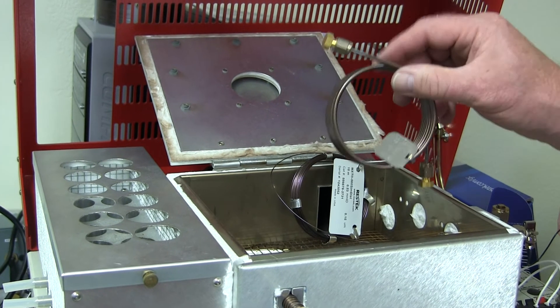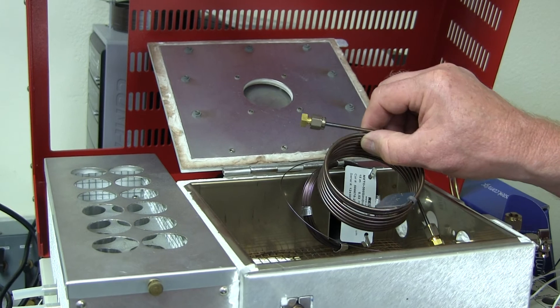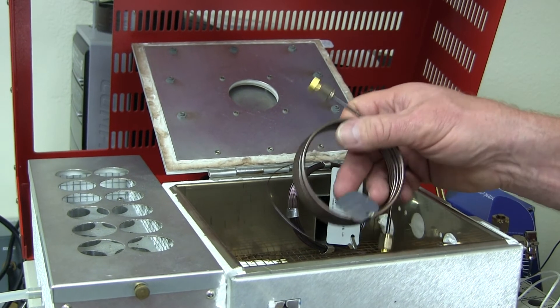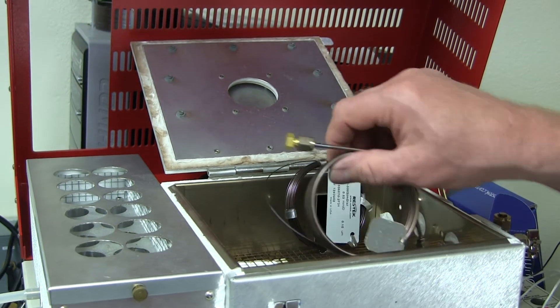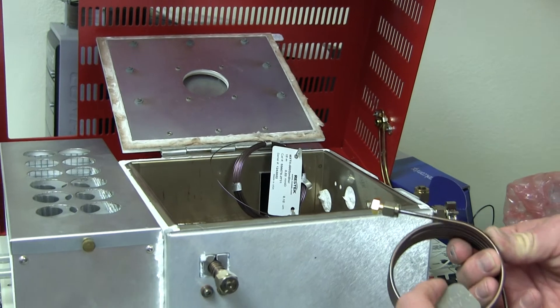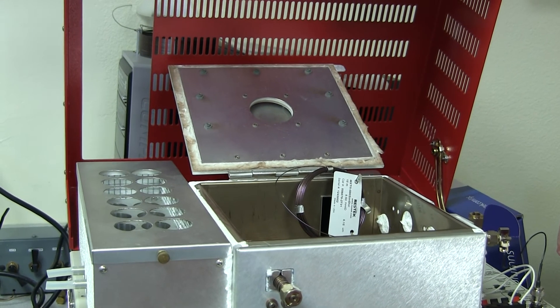It sometimes happens that there's more than one column in a column oven, sometimes two or three or four. So you really have to know which column can take which temperature, and then when you are baking the column out, you may have to remove the column that doesn't have as high of a temperature limit from the oven in order to bake out the one that does have the higher temperature limit.